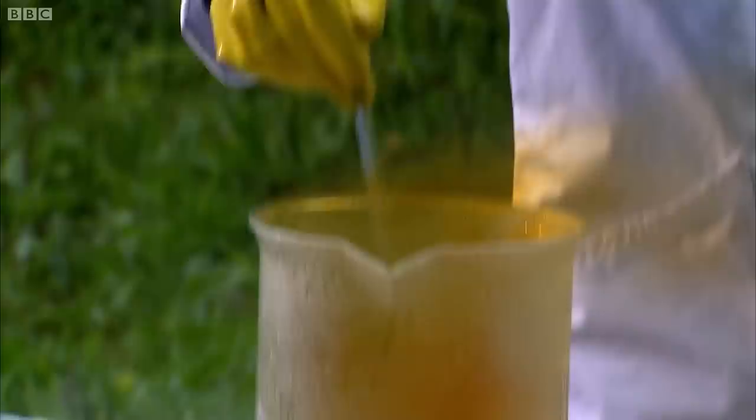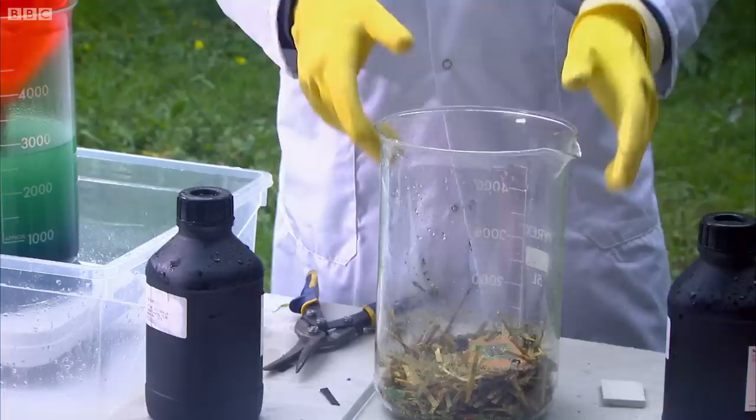This is concentrated nitric acid — really nasty stuff, especially when it's heated up. It'll dissolve practically all the metals from the circuit boards, but it won't affect the gold. In industry, they'd extract the silver and copper from this, but I've only got eyes for one thing: gold.